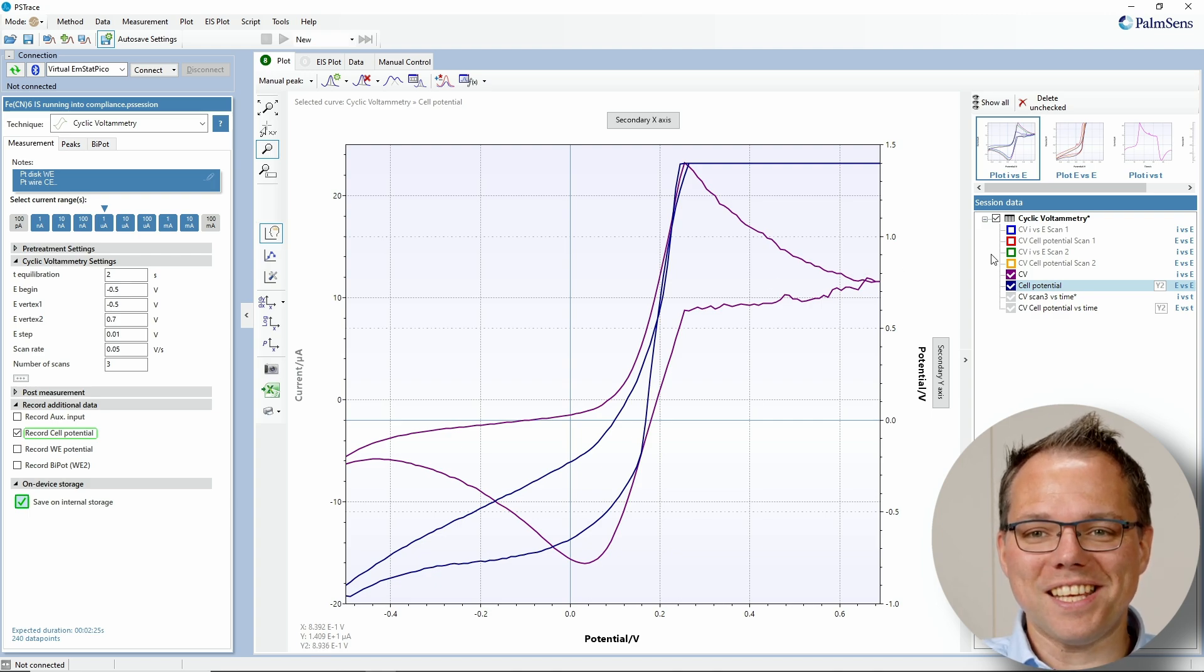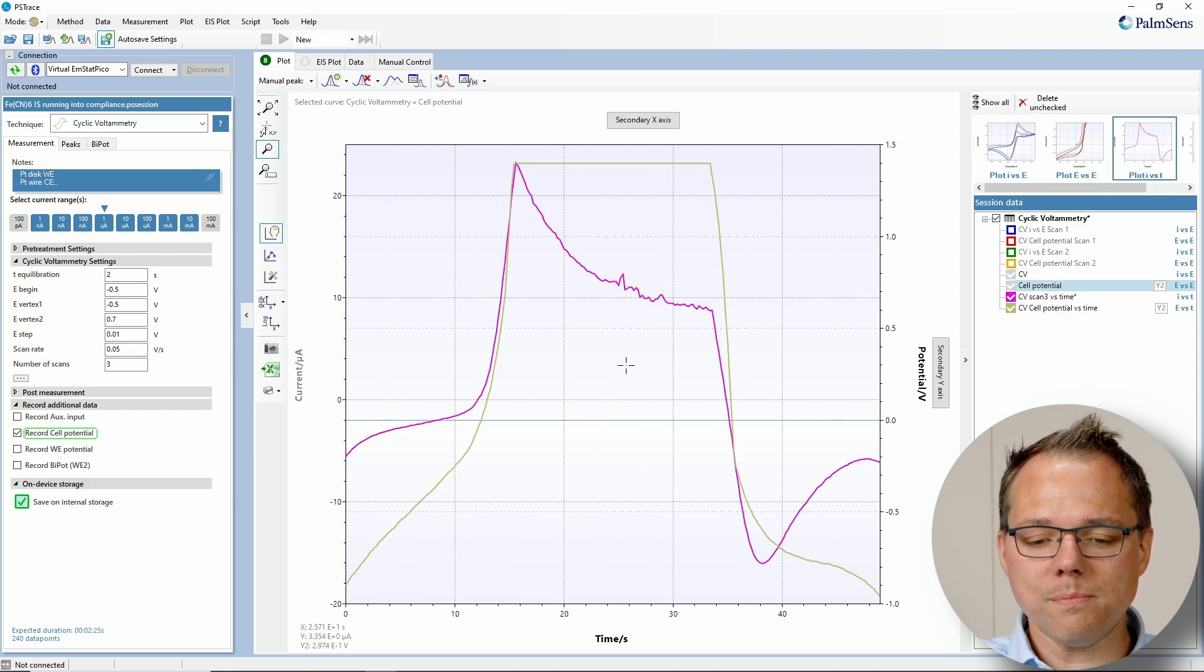Well, this we can better see in a plot of the current and the cell potential versus time. So here in this plot where magenta is our current, we see that sudden sharp peak, and the following shape of the curve is actually the result of such a current decay over time, like Cottrell behavior. And this is actually Cottrell behavior because we do apply a constant potential instead of the sweep that we thought that we are applying.